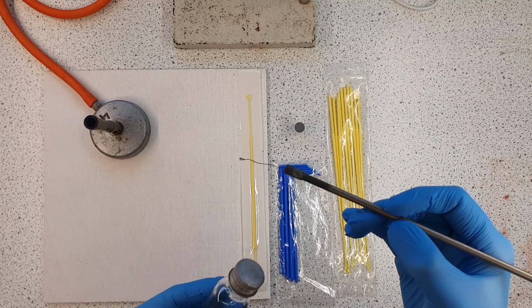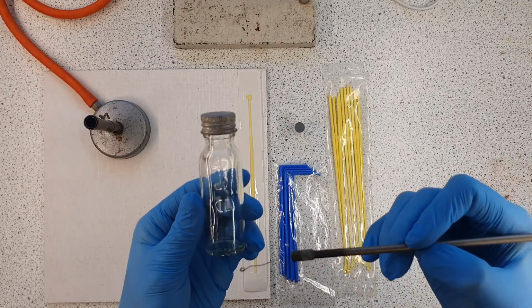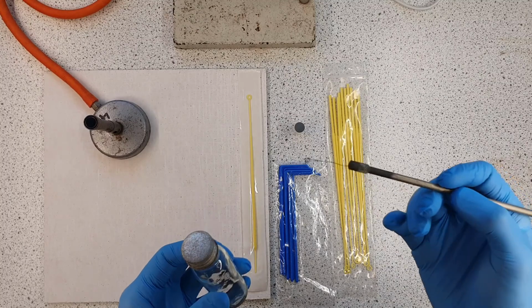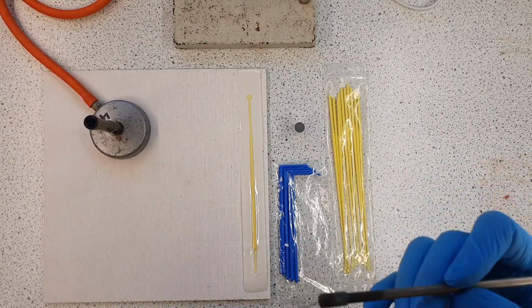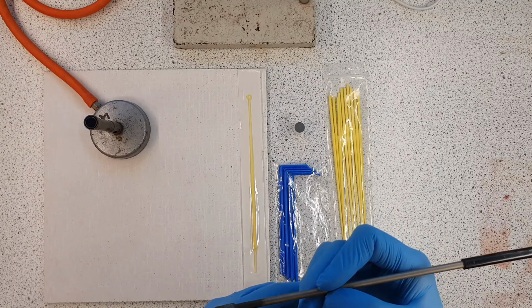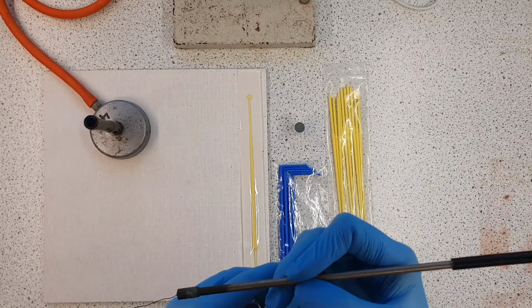So in this case, I'm going to open this McCartney bottle, and often we'll have liquid media in these things, or sometimes we'll have solid media, and in this one we've got solid media, this smaller bottle down here. So in order to minimise the exposure, especially when it comes to putting things down on the surface. Again, although we've disinfected the surface to a professional degree, we still want to reduce all chances of spreading any bacteria or contaminants.